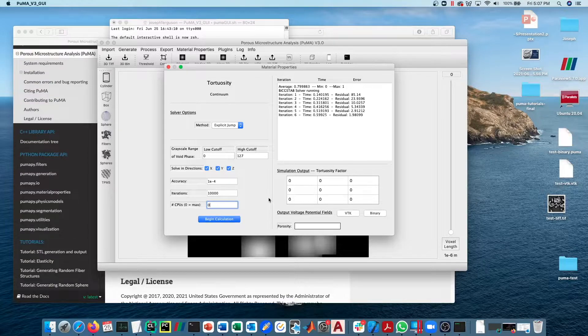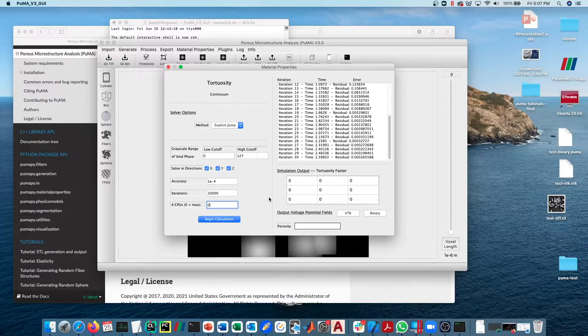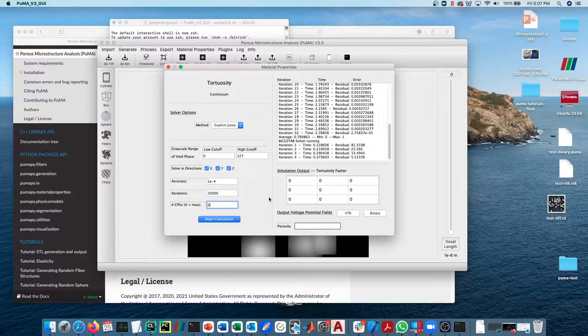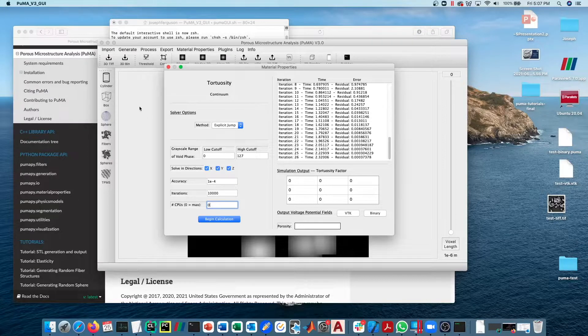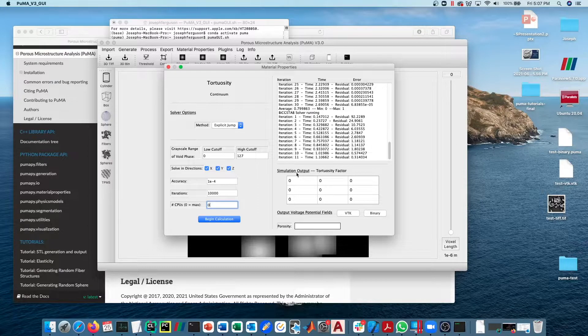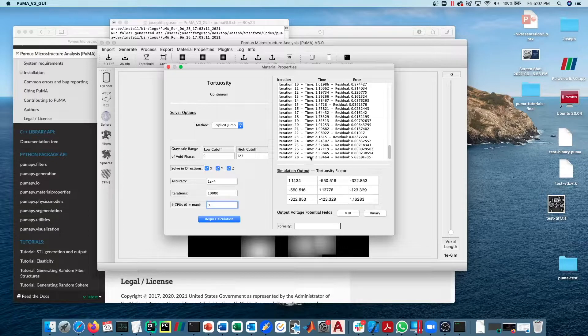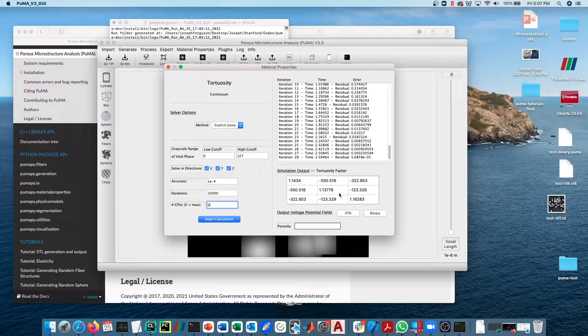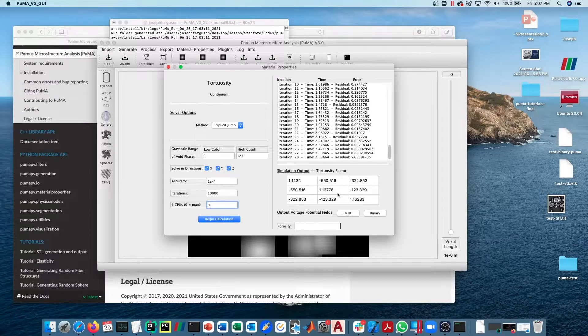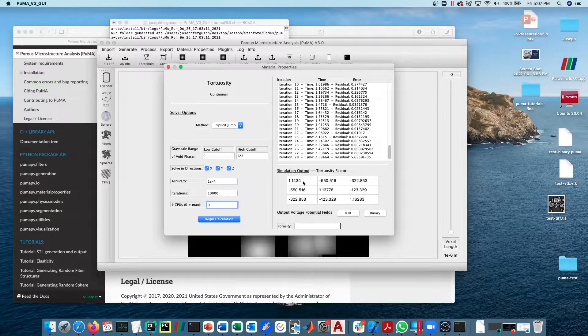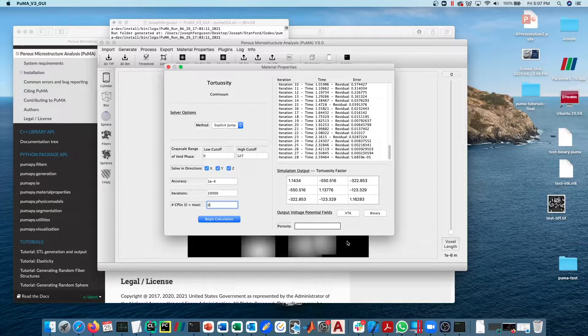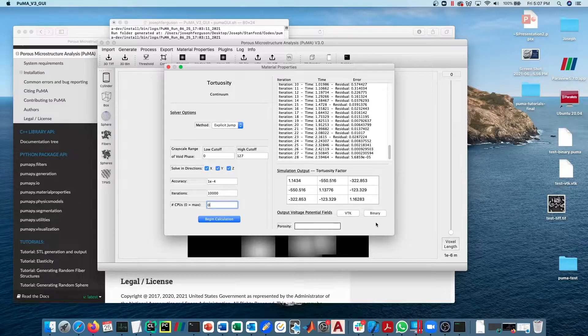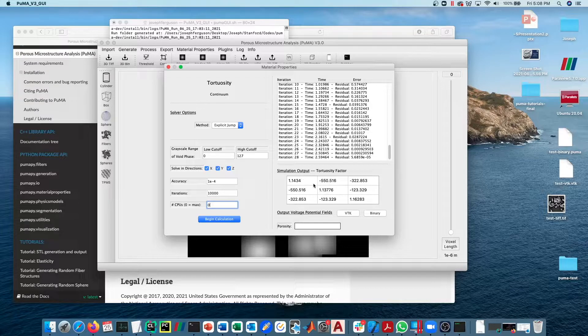If we begin calculation here, you can see that since we're running on a pretty small sample it's converging very quickly. You can see now our tortuosity values here are 1.14, 1.13, and 1.16 in the x, y, and z directions. That's roughly what we would expect given the fact that this should be an isotropic material.